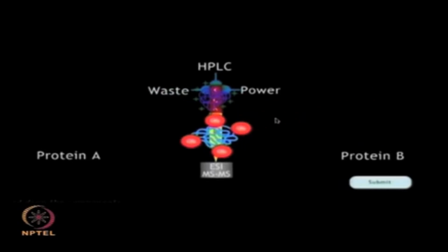So, your answer is correct. You can use the protein properties and separate those in the multidimensional protein identification technology. MUDPIT is a non-gel technique to separate and identify individual components of complex protein and peptide mixtures of a proteome. It has been shown that MUDPIT has potential to be used as a substitute for traditional two-dimensional gel electrophoresis, since it can separate peptides in 2D liquid chromatography.